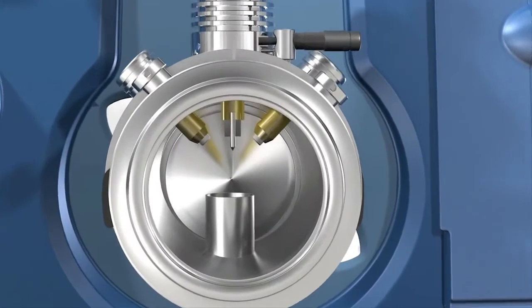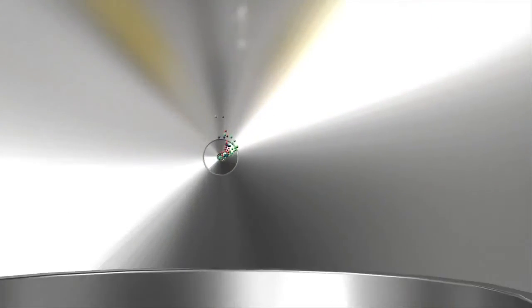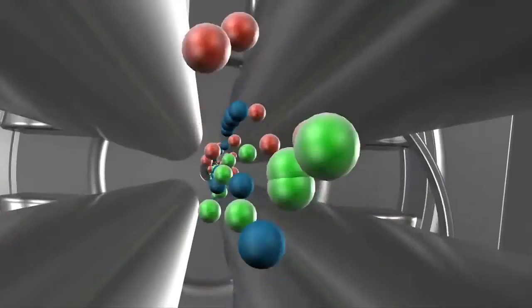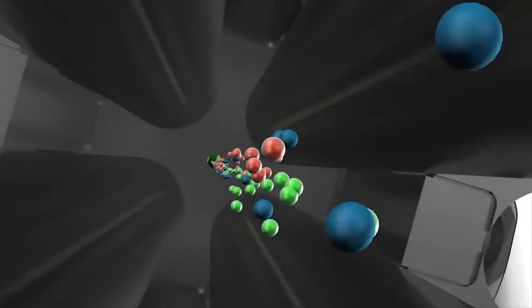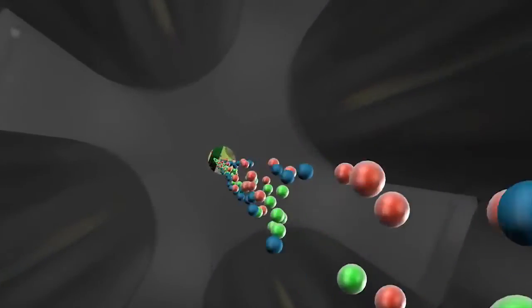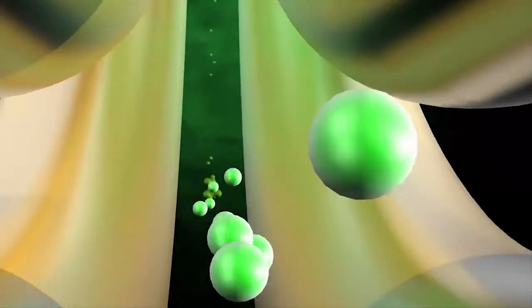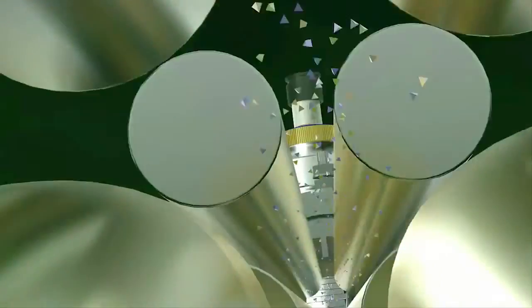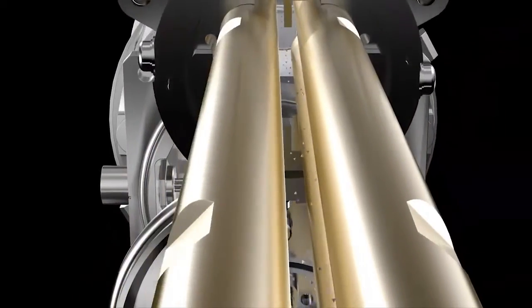The most common example is electrospray ionization. From there, the ions enter the mass analyzer. Mass analyzers can filter, select, fragment, and most importantly, measure ions of different m/z. There are different types of analyzers, but they all exploit the ions by using electric or magnetic fields to separate and focus ions of different m/z.